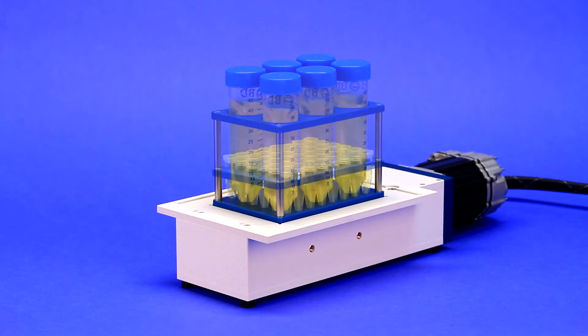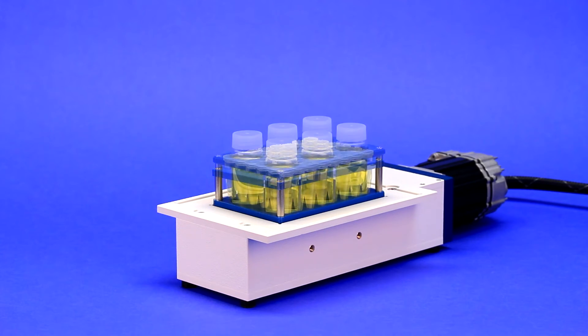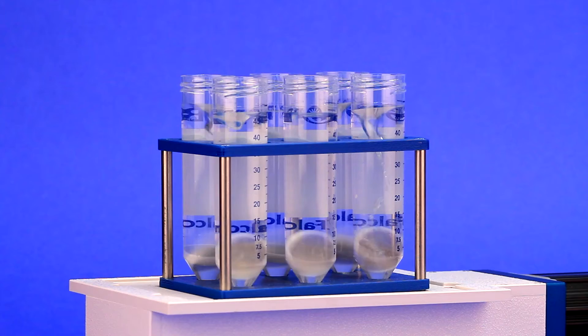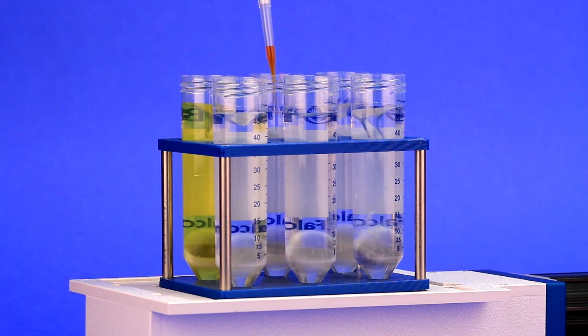The VP710C5 is our mid-sized tumble stirrer. This powerful stirrer can mix multiple samples at once. Using our magnetic disc, you can mix 50ml tubes quickly and efficiently.